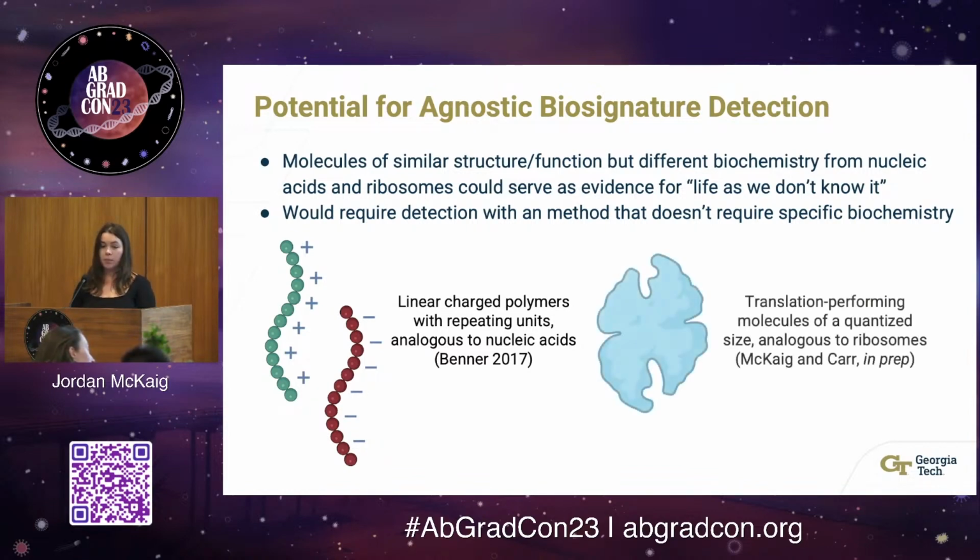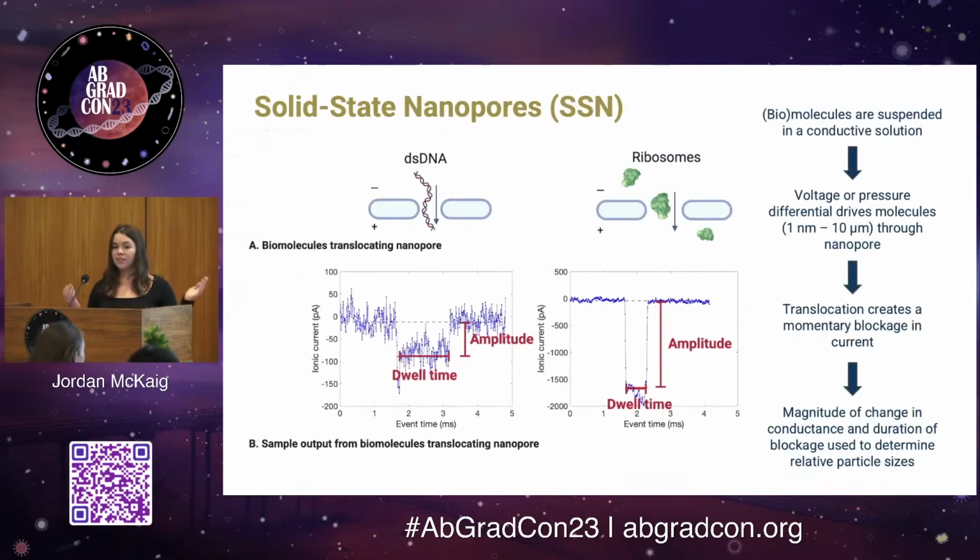And we are also working on a paper arguing that translation-performing molecules of a quantized size, analogous to ribosomes, could similarly serve this function. Since these don't have the same biochemistry of life as we know it here on Earth, it would require detection with a method that doesn't necessitate any specific chemical composition, which leads us to solid-state nanopores. This is an agnostic mode of detection, which requires a molecule to be suspended in a conductive solution.